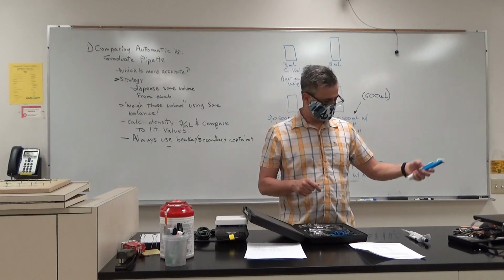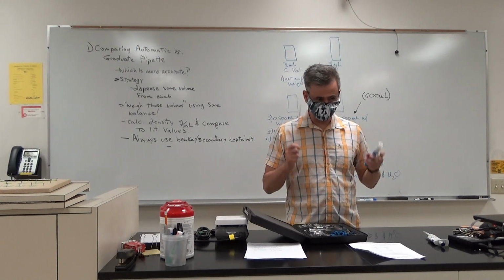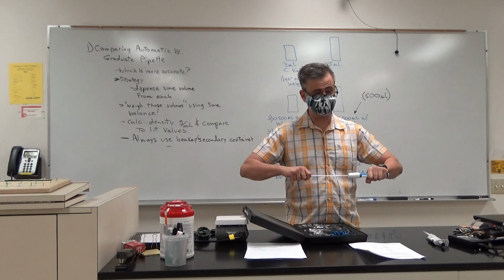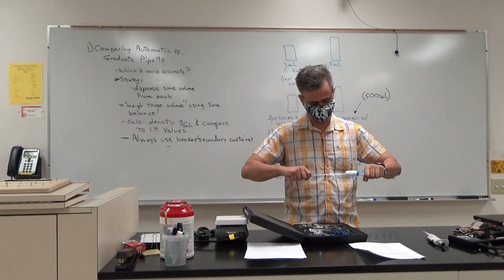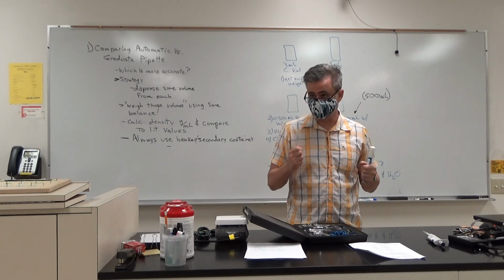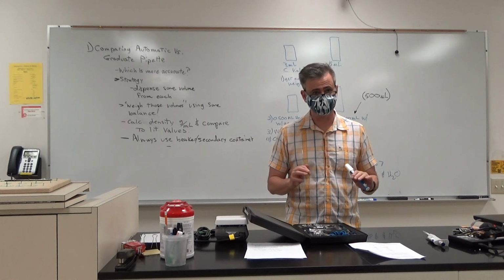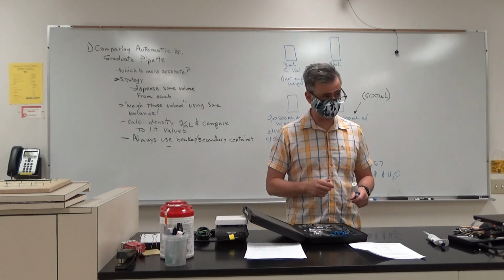Now we want to use this one. There's a critical mistake you don't want to make whenever you're inserting glass into something; you've got to be careful. This is an injury I have seen at least 5 times in working in laboratories. You don't want to hold it back here. As a general rule of thumb, if you need to use muscle with glassware, if you need to tense up at all, you're doing something wrong. You should never have to use muscle because you can cut yourself pretty bad.